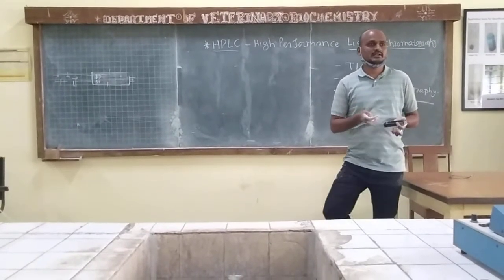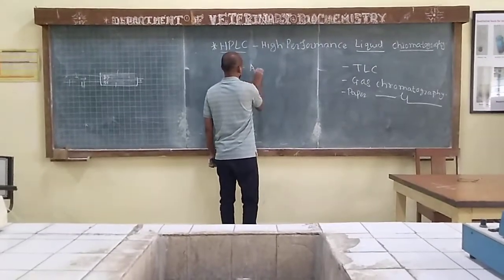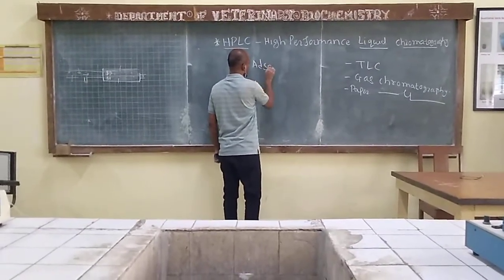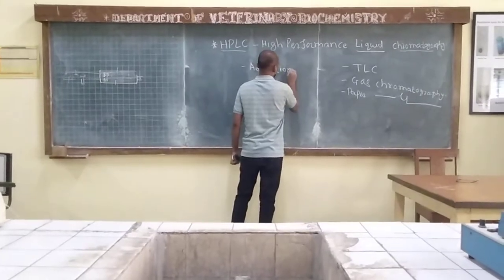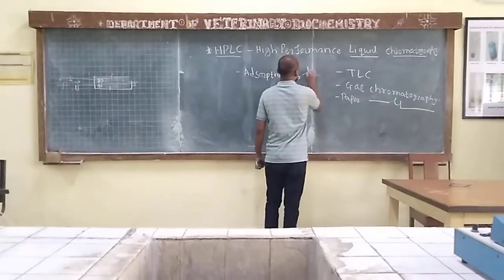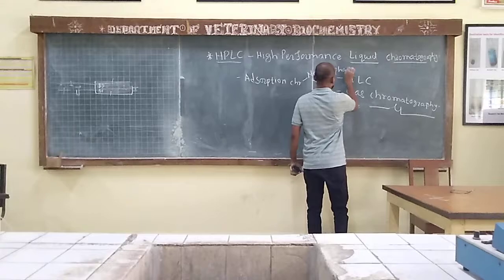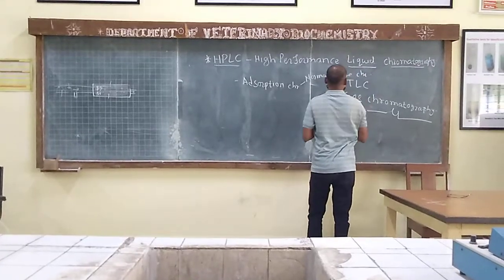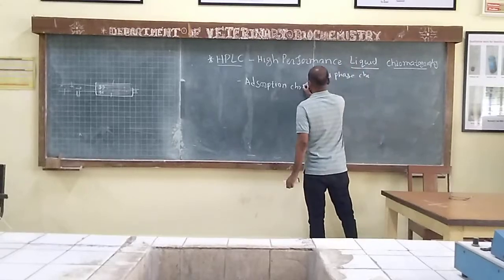So this is basically adsorption chromatography which we are seeing, and in this we have normal phase chromatography and reverse phase chromatography, right?